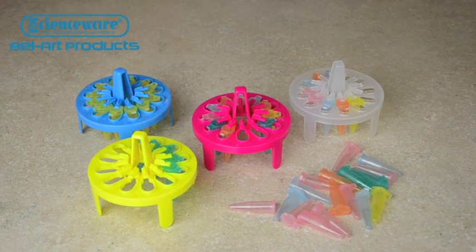Popping a top is a good thing, unless the tops are on your microcentrifuge tubes.